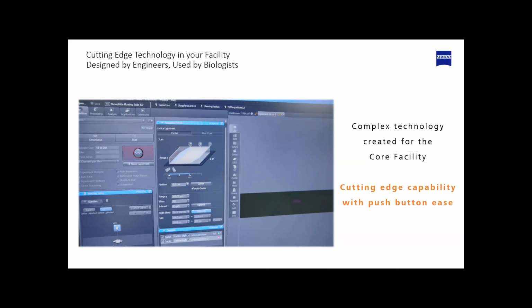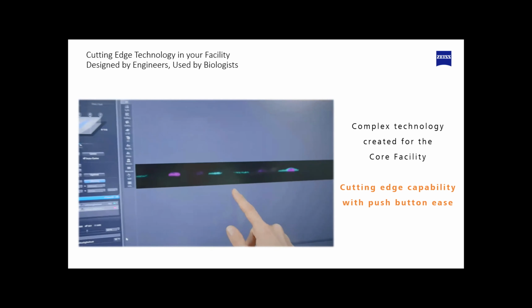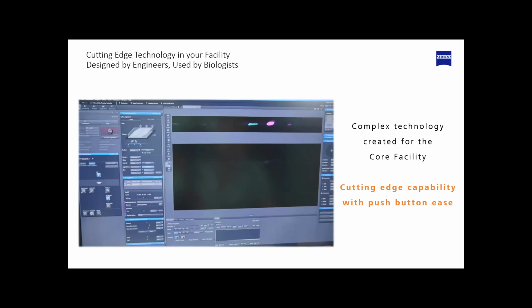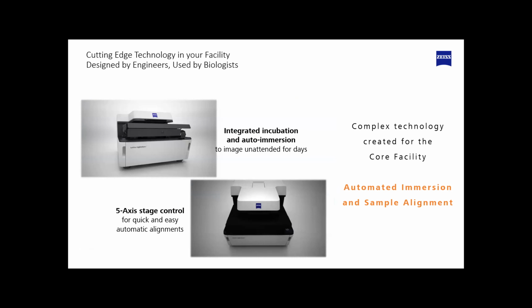So in terms of ease of use, this is extremely easy to use. This is non-deskewed image data right there. You can see that continuous Z stack or Y stack, and this is on the top the deskewed, on the bottom the non-deskewed, non-deskewed and deskewed version. So this makes it really into a functional kind of single button click microscope.